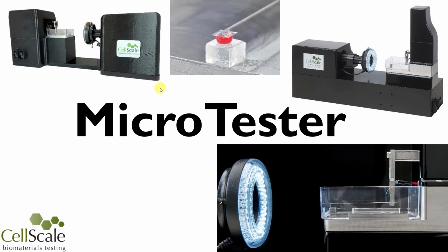The microtester series is comprised of the microtester LT and the microtester G2. These systems are designed for micromechanical testing. This is testing involving specimens that are too small or too soft to be tested on a conventional test system. This picture shows a parallel plate compression test on a microsphere about 200 micrometers in diameter. As with all CellScale systems, the microtester can be outfitted with a temperature-controlled fluid bath for testing under physiological conditions.